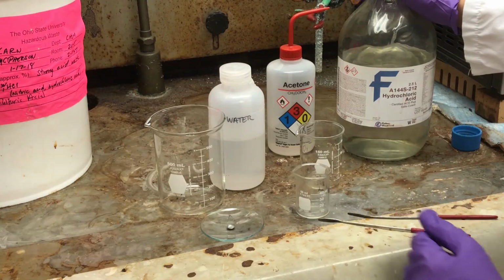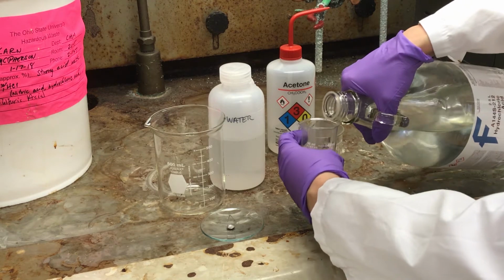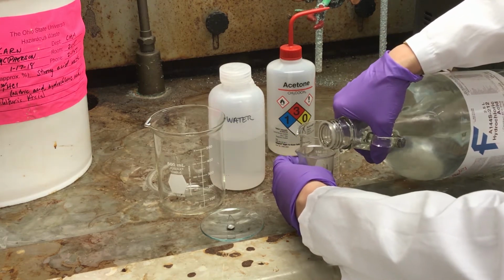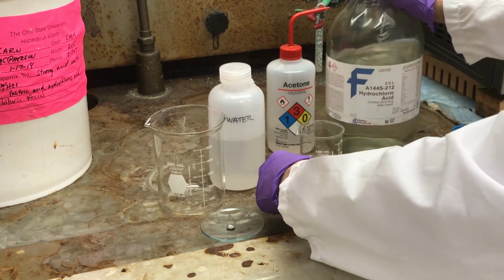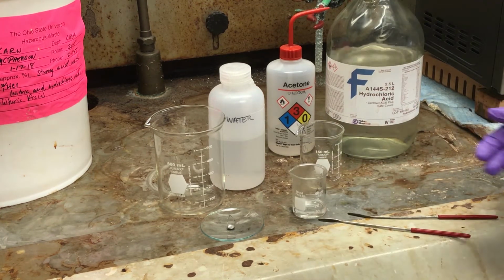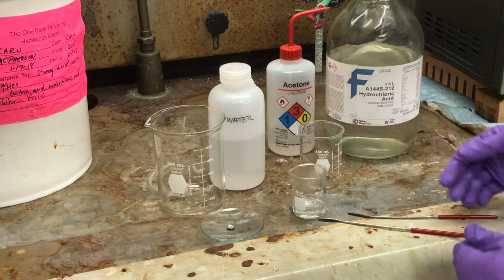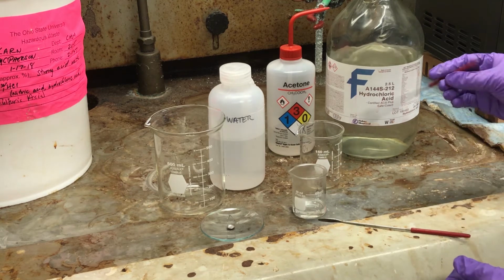Before we use our platinum pan in an experiment, we need to make sure that it's clean. So what we're going to do is clean it off in some concentrated hydrochloric acid. We only need a small amount, and this can be used multiple times. So if you're going to be running multiple samples, keep this throughout the duration of the experiment. You can wash your pan in between.